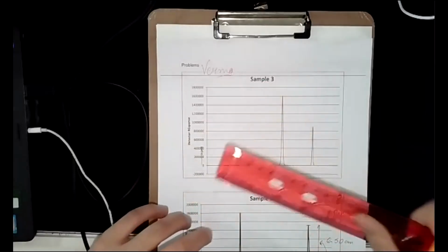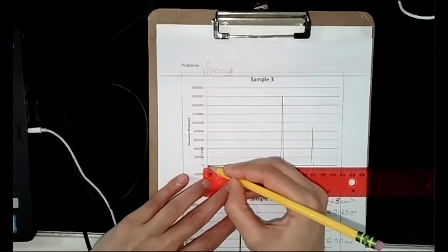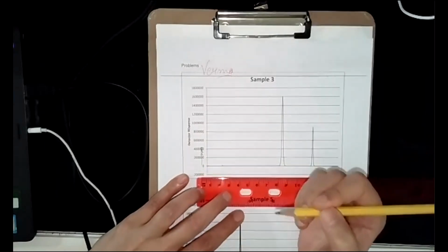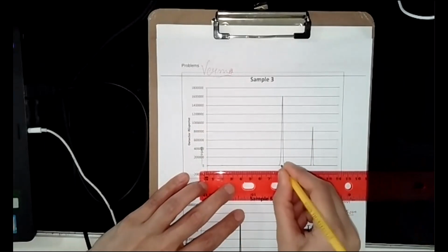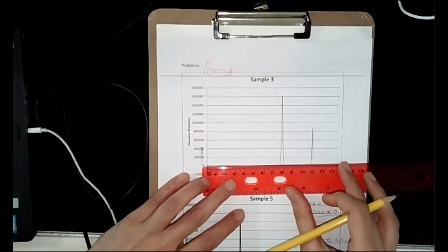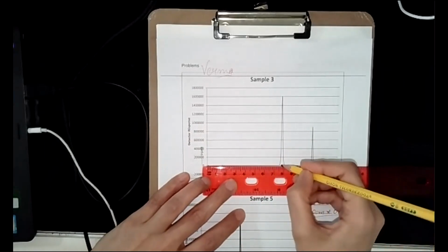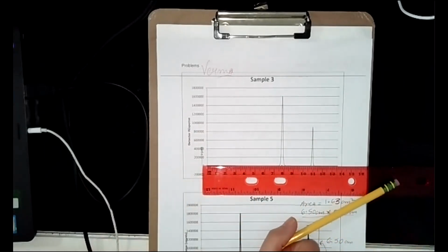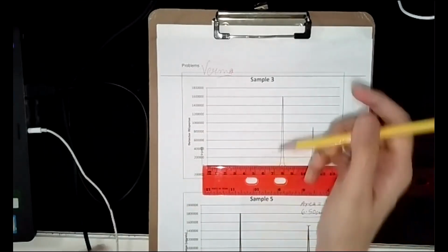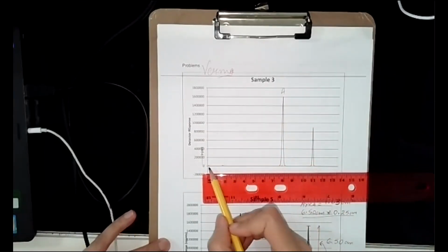So for example, for this particular sample, I will see the distance from the point of injection to the center of this peak. And I will record this as the distance of the peak A. Let's label it as A from the origin.